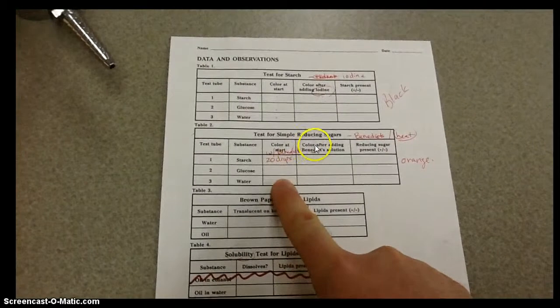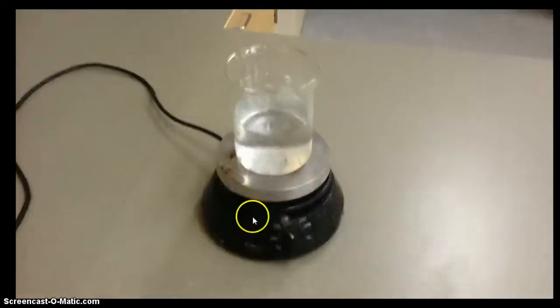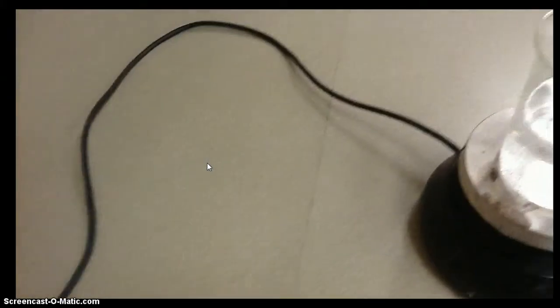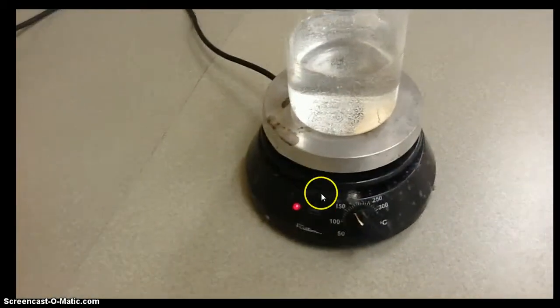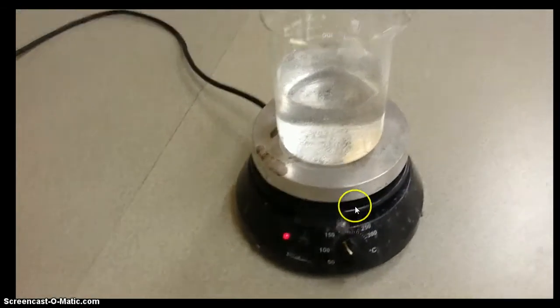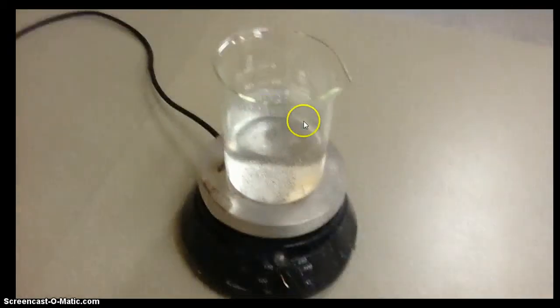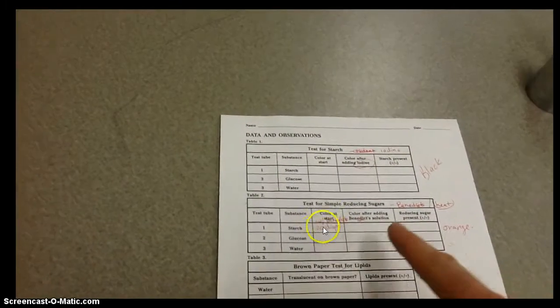Moving down to the simple sugars. We are again going to clean out our test tubes. So brand new test tubes here, washed them out. We are going to be using heat in this example. Now, this is where a Benedict solution has to be used with heat. We are going to plug in the hot water bath that is at your lab station. The red light should turn on, and it should be no more than about 150 degrees C. From there, you are going to just place in those 3 test tubes, again labeled 1, 2, and 3. This is a brand new set of eyedropperfuls of starch, glucose, and water. And you need approximately 20 drops of Benedict solution.